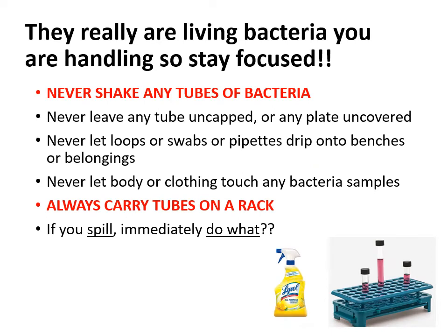Now, please keep in mind that if we do make it to the in-person weeks, you are handling actual bacteria, okay? The tubes we give you may look like lemonade or some beer, the coloring, but it's not. It's actually bacteria in there, and they are alive. And if you are not careful, they can cause you harm.